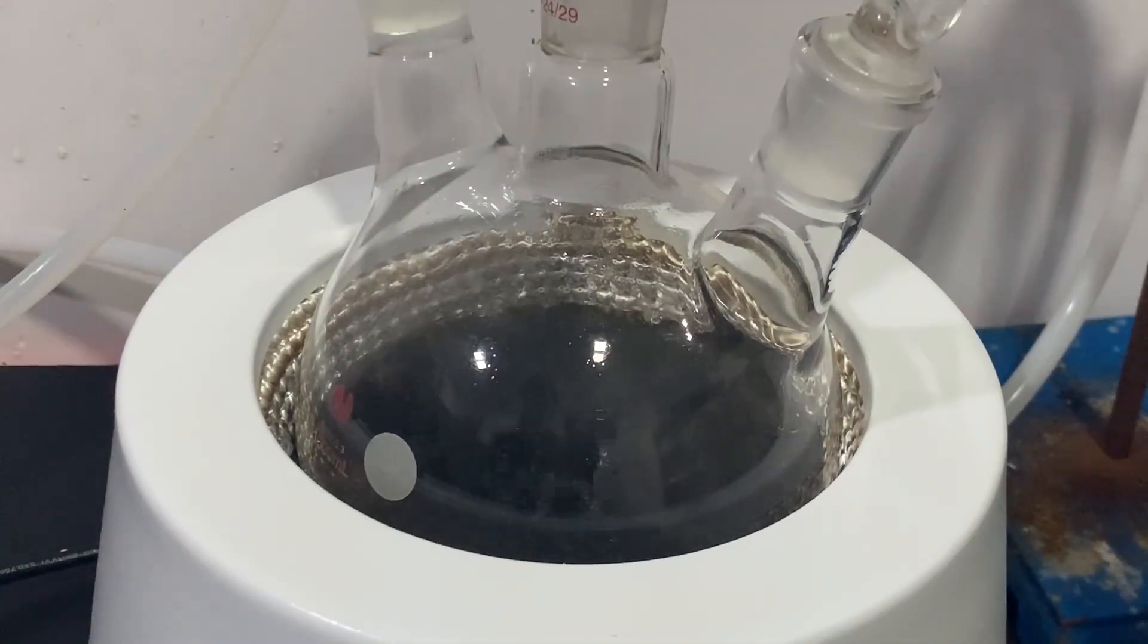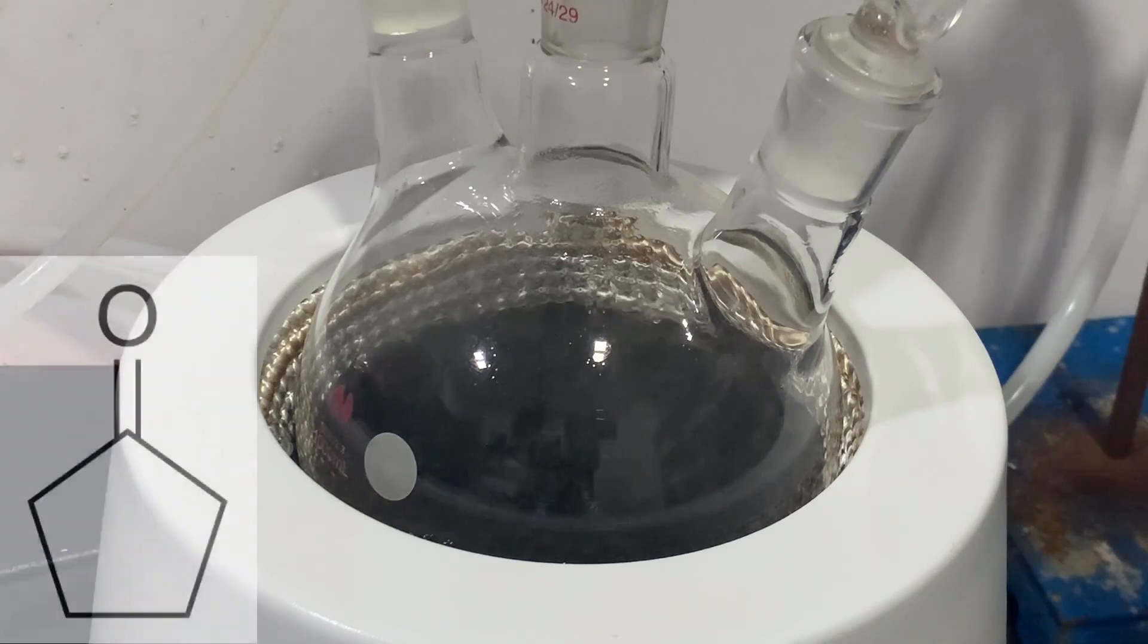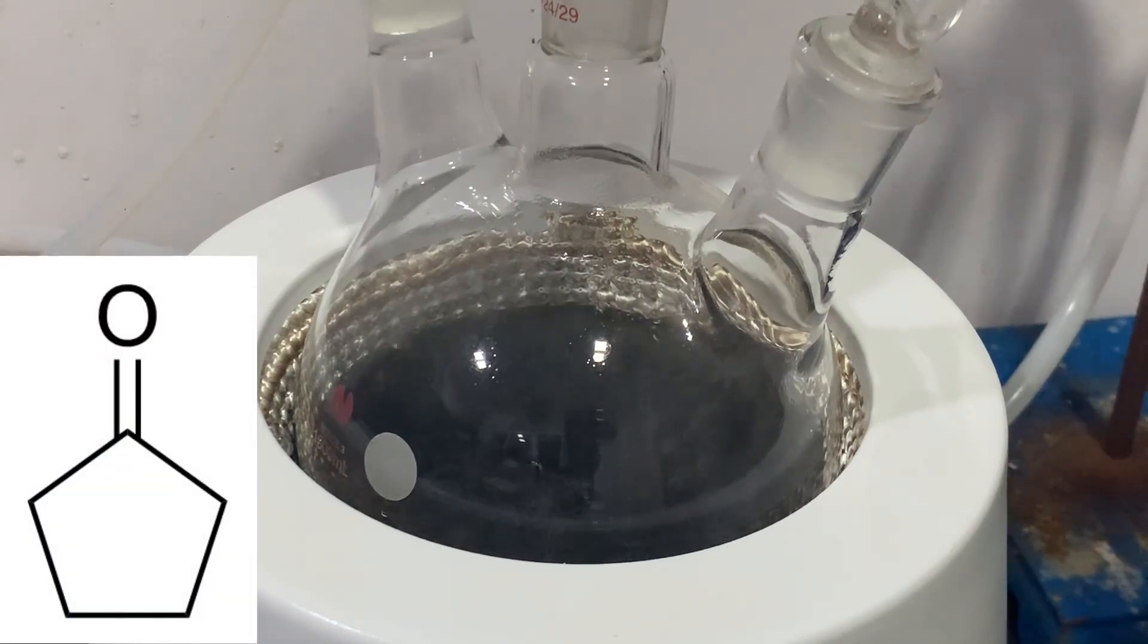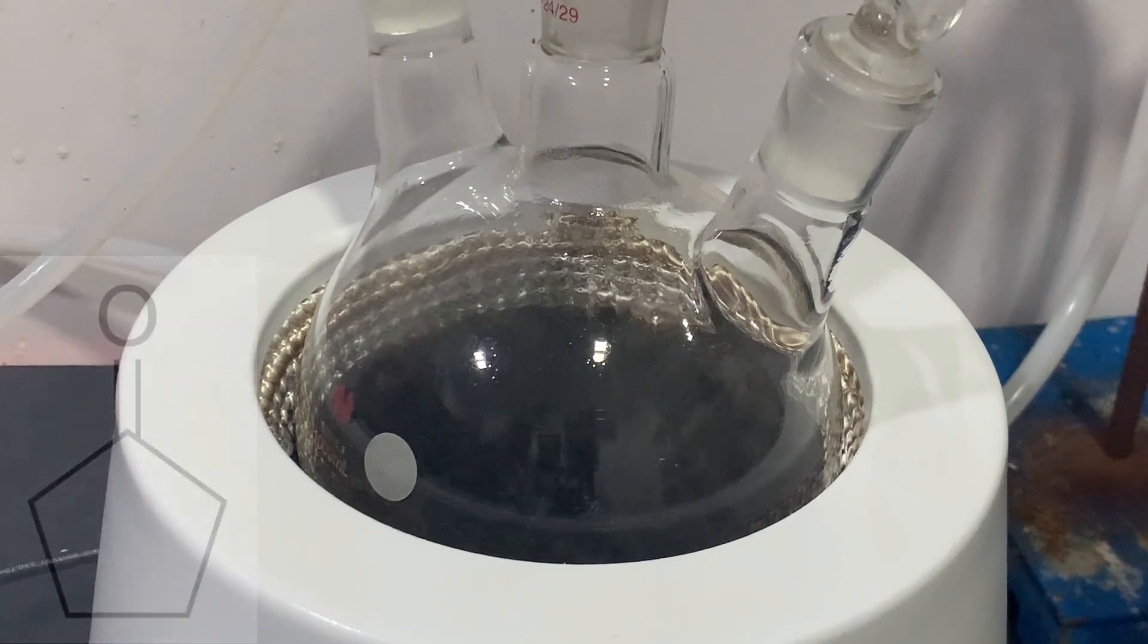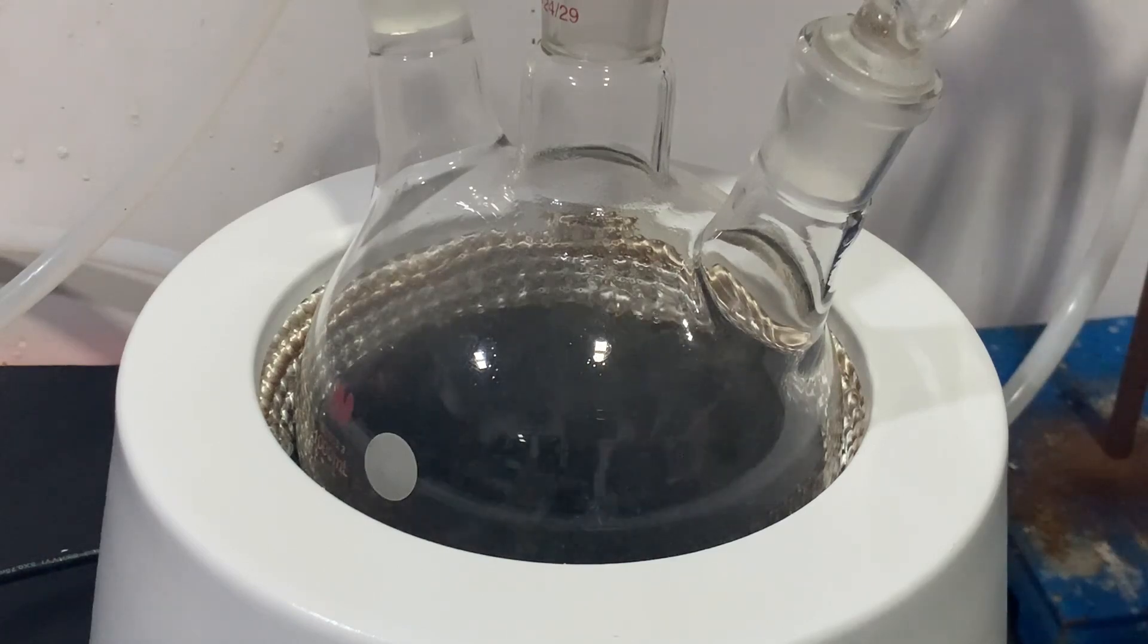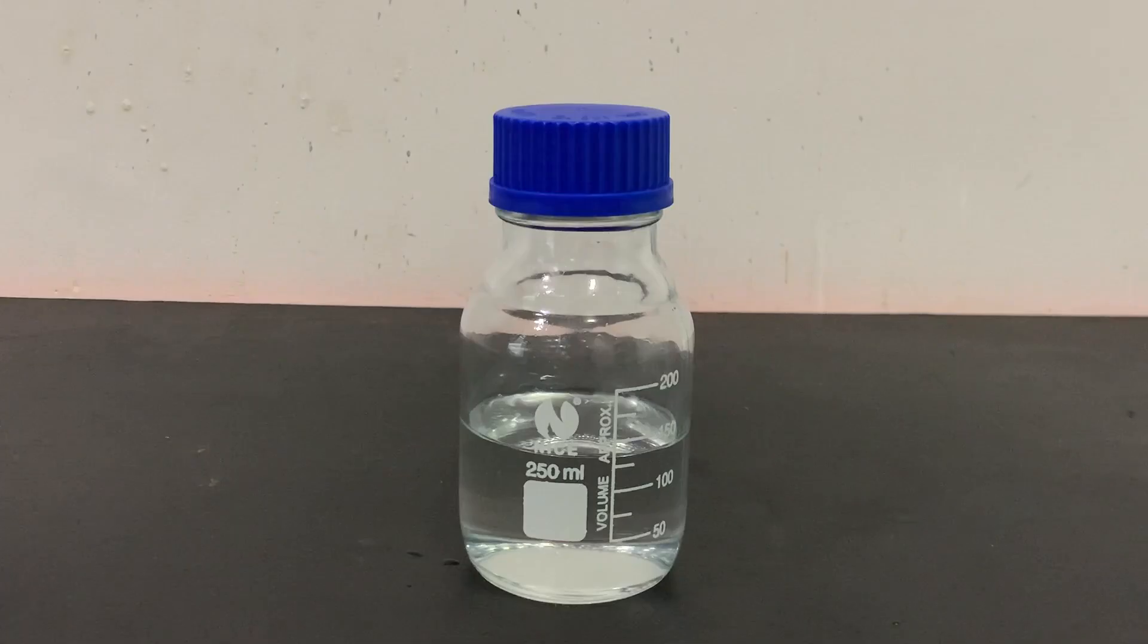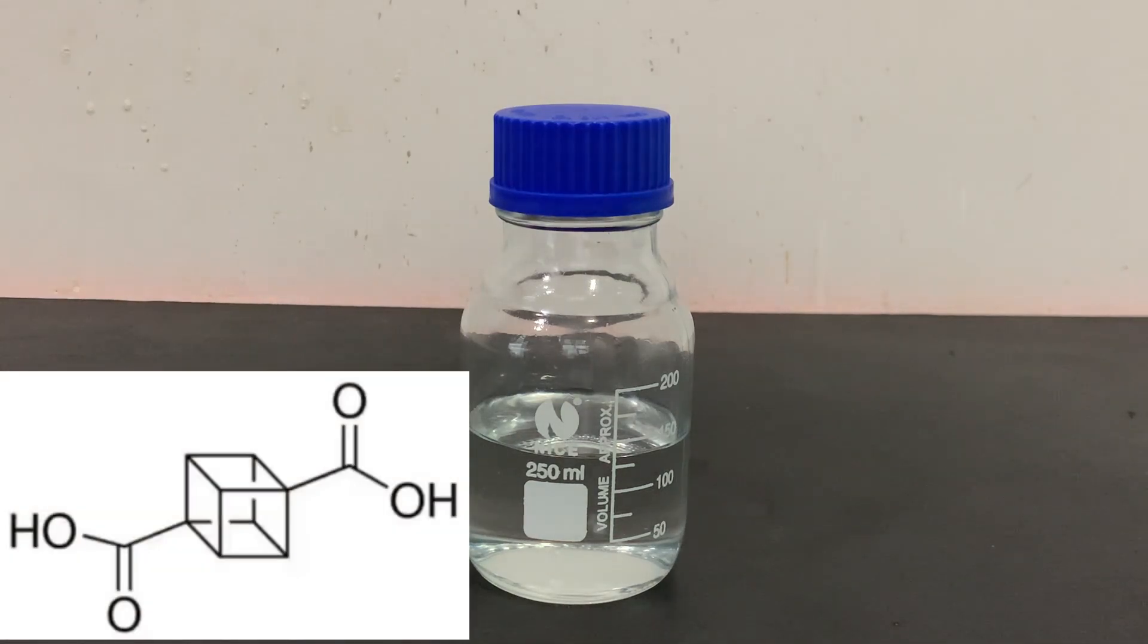In today's video, I'm going to be doing the synthesis of cyclopentanone from the decarboxylation of adipic acid. Cyclopentanone is used as a chemical building block for a variety of organic compounds. For my application, I plan to use it as the starting material for making cubane-1,4-dicarboxylic acid.